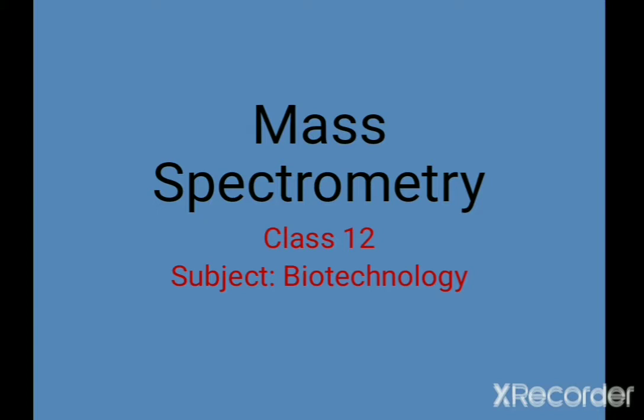Today, again, I have come up with a new topic, that is mass spectrometry, and it belongs to class 12 subject biotechnology under unit 5, protein and gene manipulation, second chapter, protein structure and engineering.